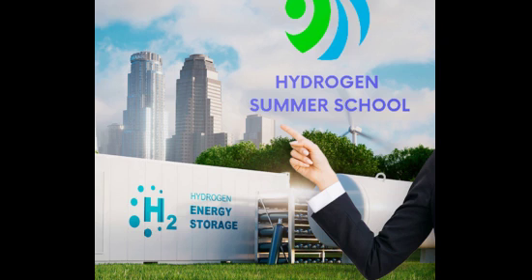Ventilation. Ensure good ventilation in the lab to disperse any hydrogen gas buildup and prevent it from reaching potential explosion concentration. No open flames or sparks. Avoid open flames or sparks in the vicinity of hydrogen gas, as it can easily ignite and cause a fire or explosion. Leak testing. Always check for gas leaks before starting the experiment. Use soapy water or a hydrogen leak detector to identify any leak in the gas delivery system.